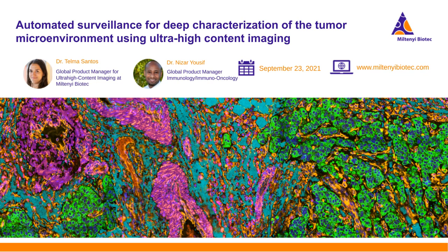Yes, so it's quantitative. We have a list of very usual features related to the fluorescence, but also the shape and the location of the cells after segmentation. So all of this is quantitative and can be analyzed in different ways and manners, but it's a very quantitative way for sure.